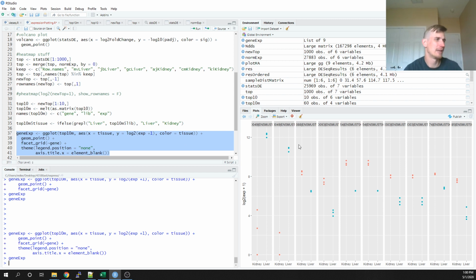Okay, so if anything else, it just widens this out a little bit. So I don't have my x title, and I don't need the legends presently. I can interpret what's happening without those two variables present.